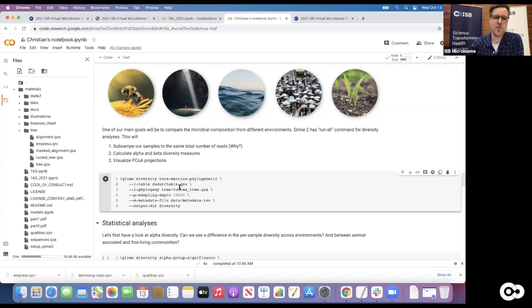We have very few things that we actually sequence in that sample, so you might actually miss some organisms. It's the other extreme as well. We might have a sample which has like 1 million reads, so even extremely low abundance organisms will still get sequenced. So there's a bias there: really deeply sequenced samples might actually generate higher alpha diversity measures just because we sequence them with more reads.